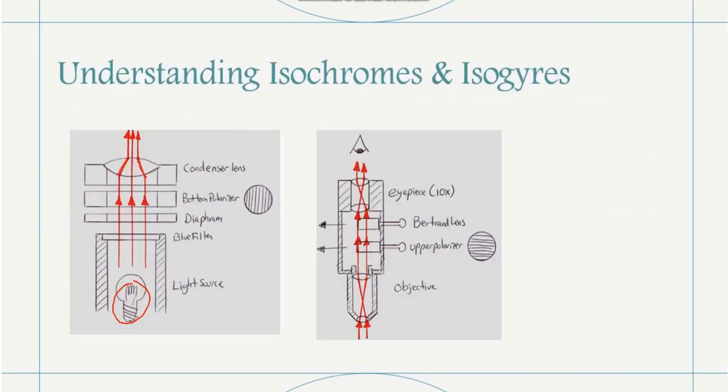Remember we mentioned that from the source, the light will pass through the diaphragms, and then converge at the auxiliary condenser lens. For a uniaxial indicatrix, the light emerging from the center will show a strong convergent light, and this light will pass through a mineral.